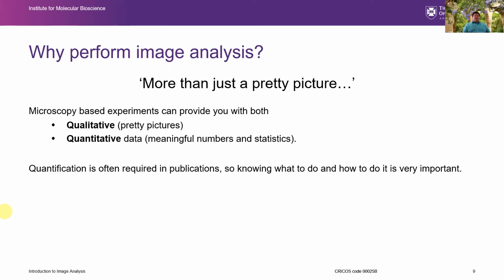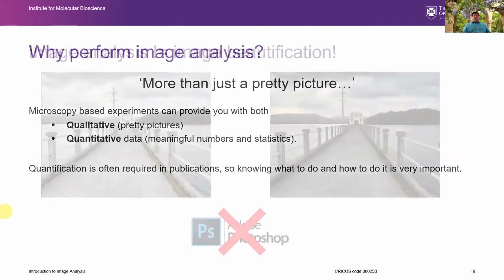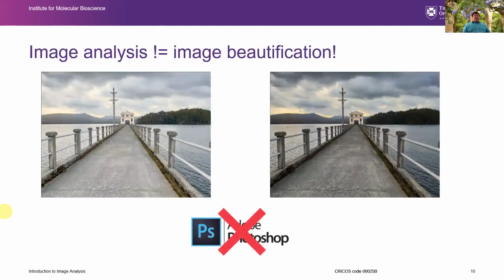Often we're seeing a lot of researchers come to us saying publications are requesting that we have quantification, and so knowing what to do is really important. Image analysis does not equal image beautification. So when we do things in Fiji or any of the commercial programs that we have, we're not just trying to make the image look pretty. It's not Photoshop. You shouldn't be using Photoshop for any of your microscopy image processing or analysis.